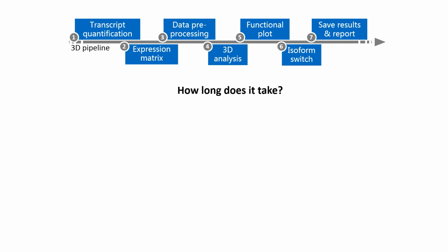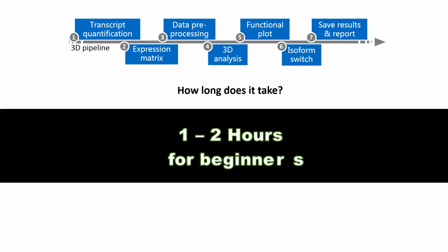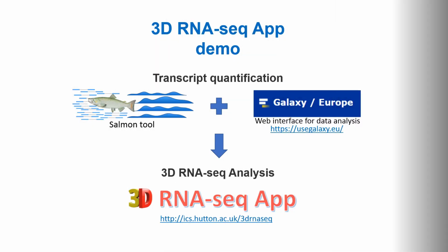So, how long does it take for the whole analysis? The answer is 1 to 2 hours for beginners. I'm going to do a demo of the 3D app.